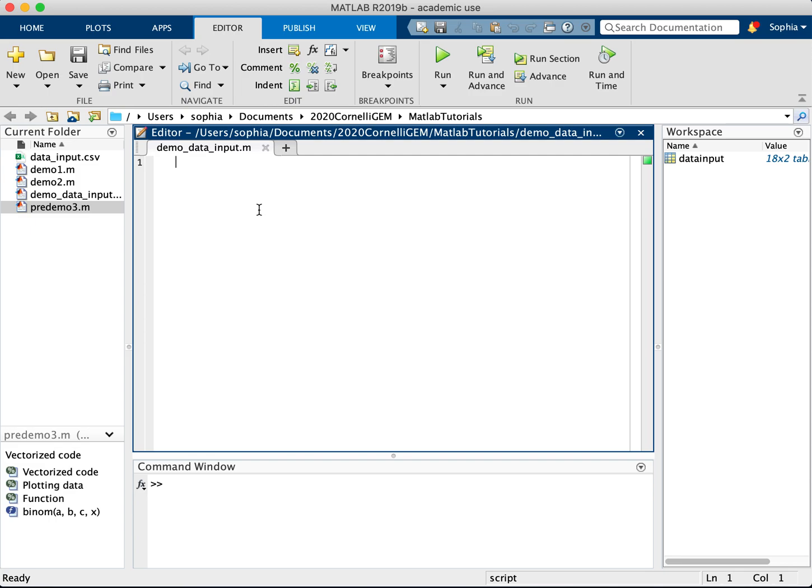I'm going to be showing you guys how to input data. So for example, if you've used any sort of machine, a plate reader, anything that gives you an Excel file for data, I'm going to show you guys how to input this.